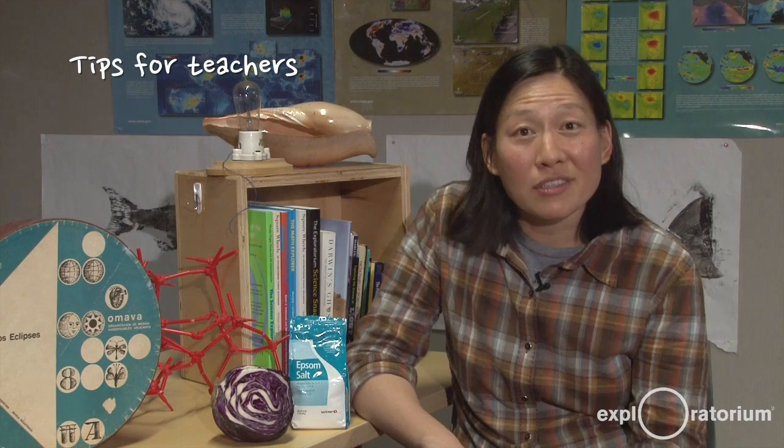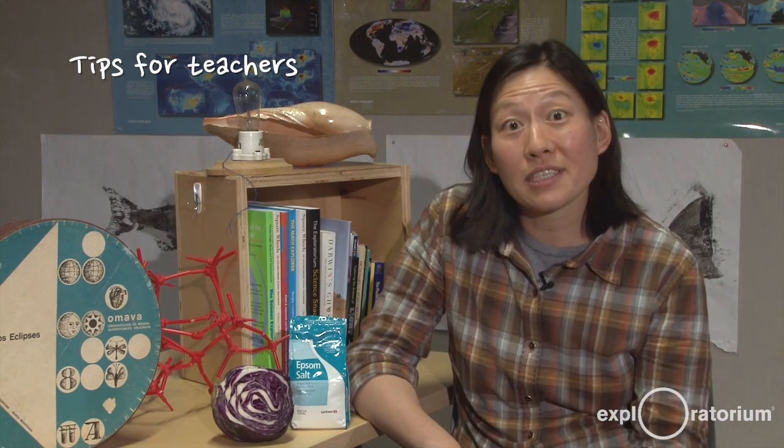Two quick things about materials for this activity. The first is the pH indicator. You may be asking, can I use another pH indicator? And of course the answer is yes. So if you have bromothymol blue or phenol red or something else that you like, it'll work. My personal favorite is red cabbage juice because it's cheap, it's easy to make, it's easy to get, and beautifully has three different colors for acid, base, or neutral solutions.